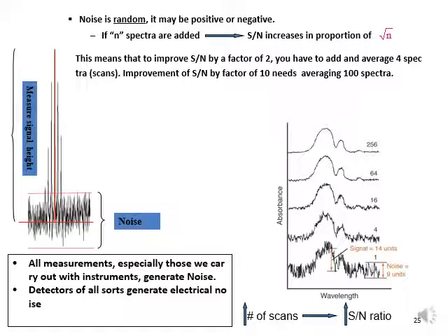What I want to say here is that by increasing the number of scans, you are actually increasing the signal to noise ratio, which is good.